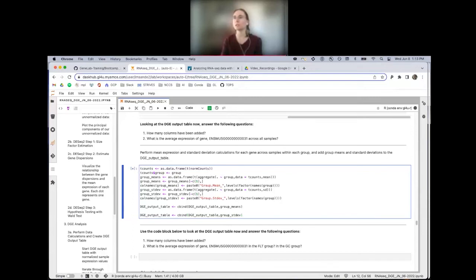Yeah, so the reason that I asked you to start this code block running is because it takes the longest to run, as Amanda says. And I wanted everyone to get a head start. So mine just finished, which means that I now have a number instead of an asterisk, and my kernel says idle. So that kind of goes together. When nothing's running, it says idle. When it's running, you have an asterisk, and it says busy.